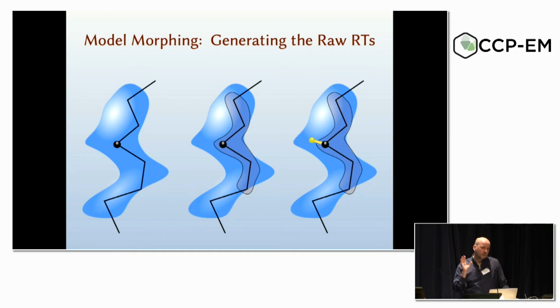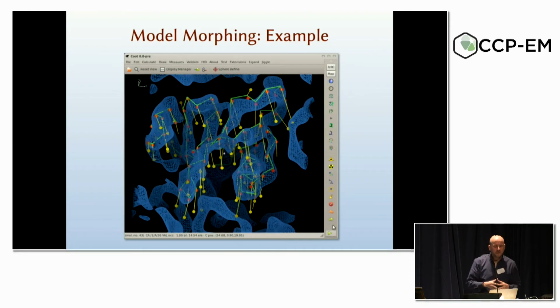We ask that question for each residue in the structure, and then combine the rotation translation operators with averaging and a robust system, so we are rejecting outliers in the rotation translations, and applying each of those rotation translations in a local environment to bring the residues closer to the high density parts of the map.